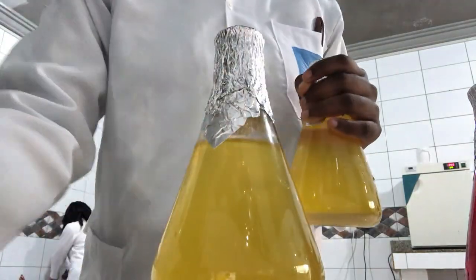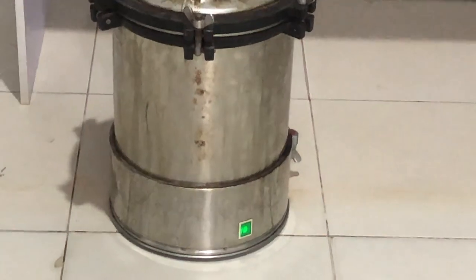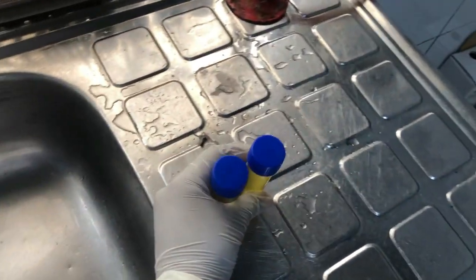At this point we had finished and we put the media into the autoclave to get sterilized before we could do anything else. After that, we had urine samples, so I just took the samples to the sink so I could work on them.